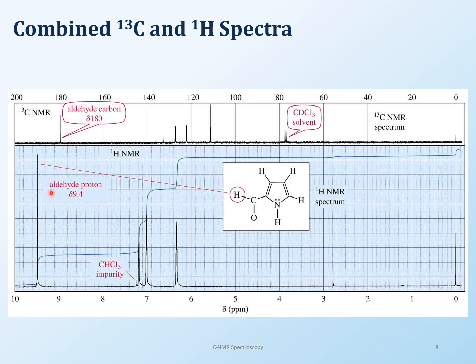So you can correlate a little bit and say, oh okay, I have something that is very downfield shifted. That will help a little bit. This is all aromatic, since pyrrole is an aromatic compound, so aromatic protons are going to show up around 7, just like benzene will. You can help yourself a little bit if you have the two spectra right next to each other, and the computer can do this for you. You run both of these spectra one by one, and once you have them together, you can manipulate that a little bit.